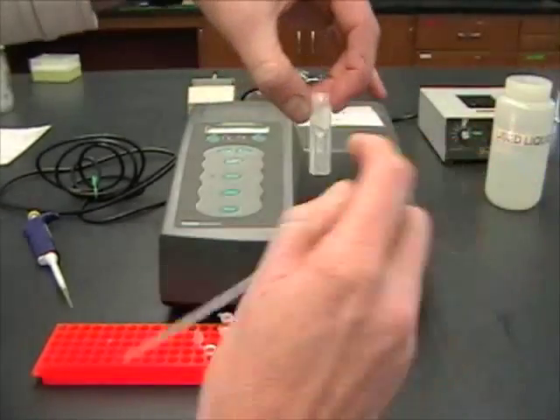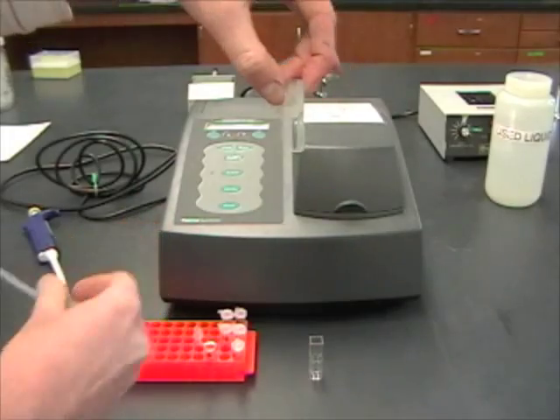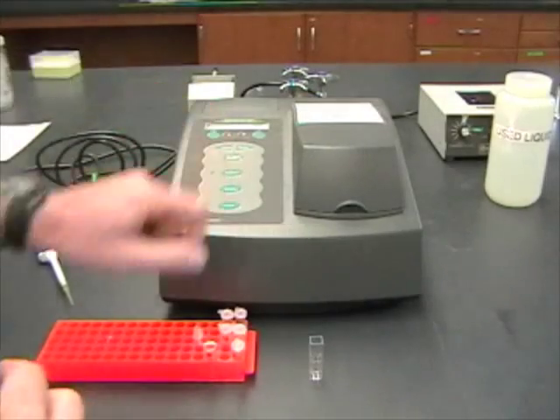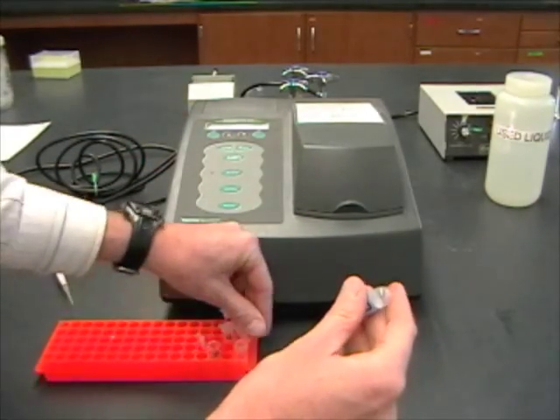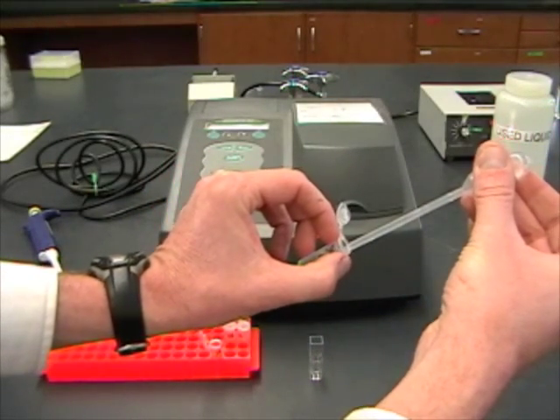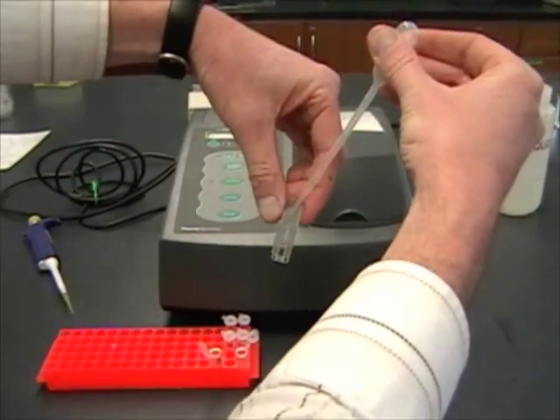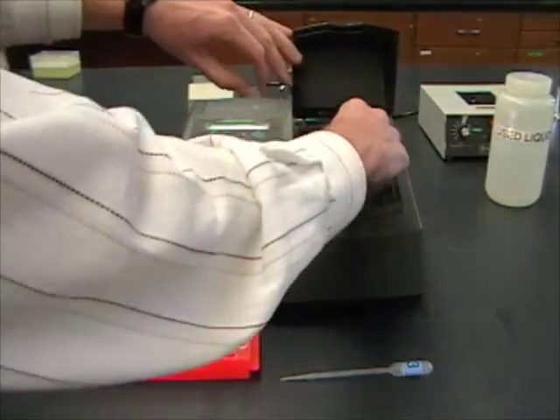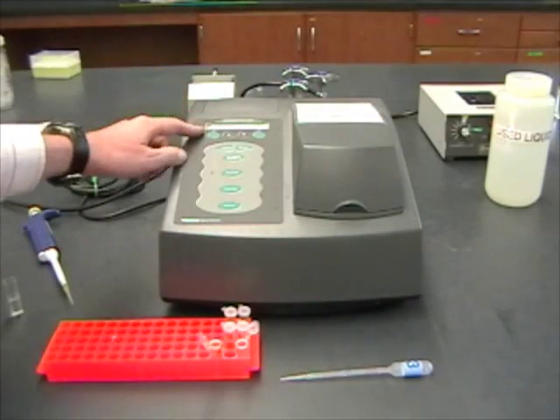I'm going to transfer that to my cuvette. You can see it's pretty much filled up to the top of the little window, so about 500 microliters is enough. This is my blank, so I'm going to put it in and blank the machine. While I'm doing that, I can get my tube that had the ONPG in it and transfer that in. The machine's blanked, so I can pull this out, put in my ONPG, and then read and record the OD.